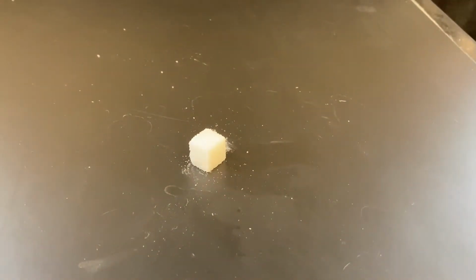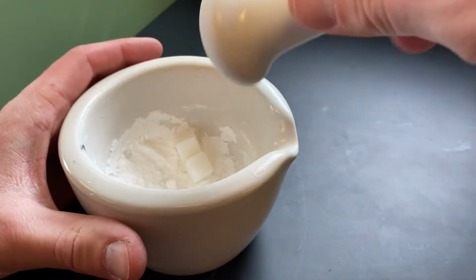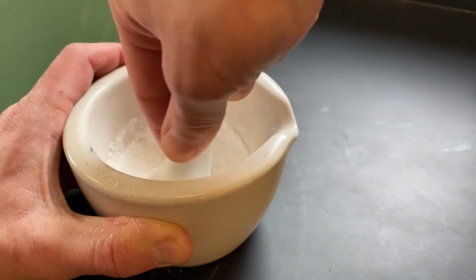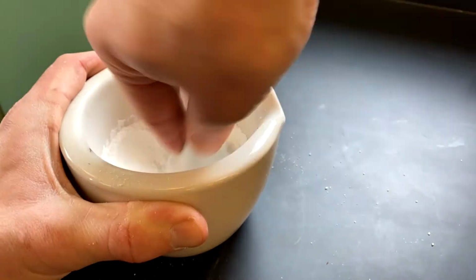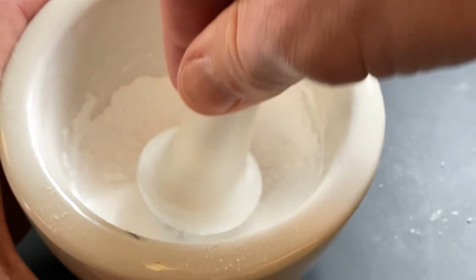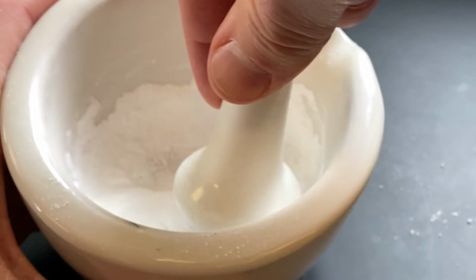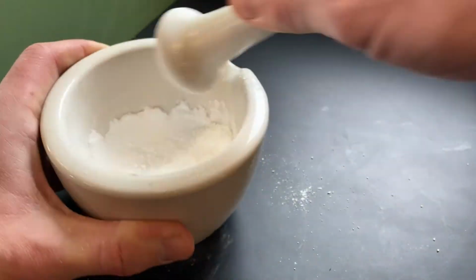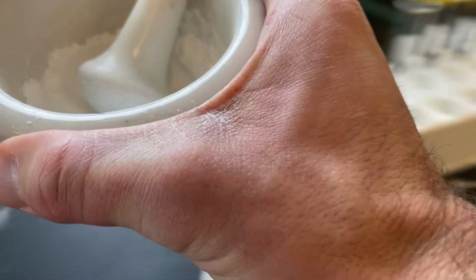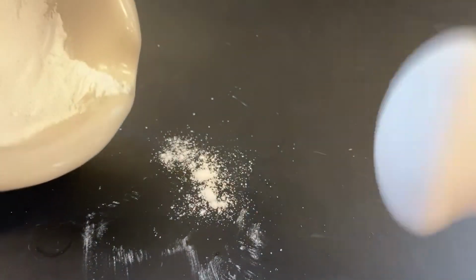Okay, so now what we're going to do is I'm going to take my mortar and pestle, and I'm going to grind the sugar up using this little mortar and pestle here. Okay, I think I'm almost just about there. Let's take a look. It no longer looks like a cube. Let's pour some out onto the table right here.